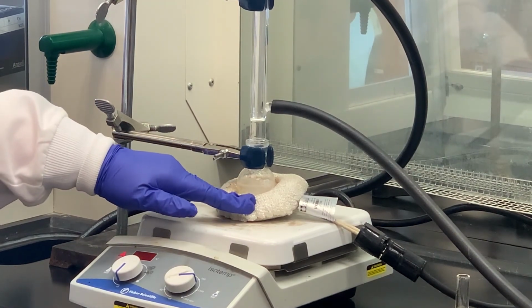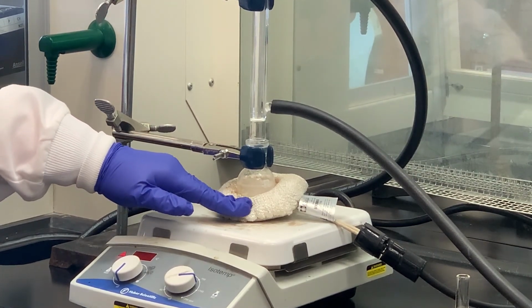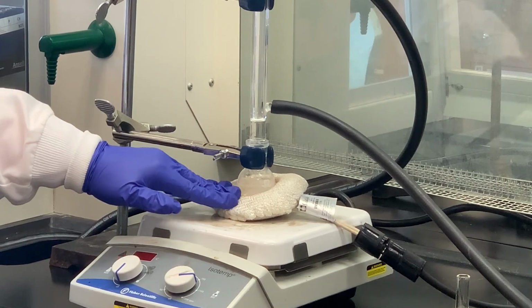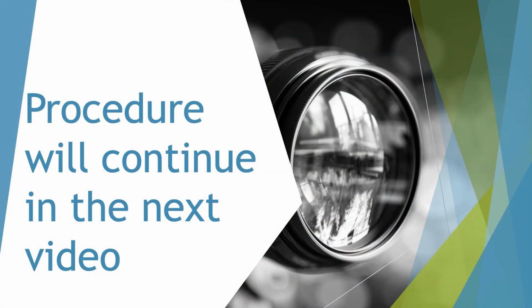It's been 30 minutes since we were heating this under reflux, and as you can see, all the solid has dissolved. So I've turned the heat off. We're going to let this cool to room temperature, and then we'll follow the next step of the procedure.